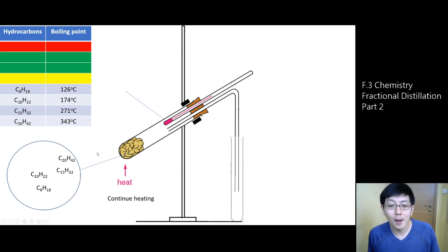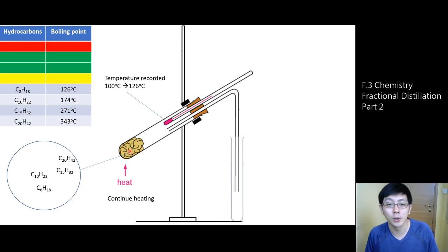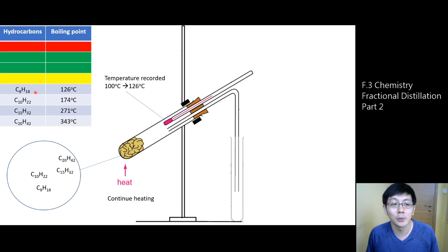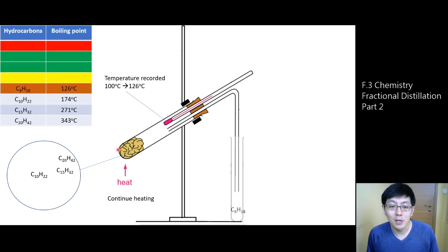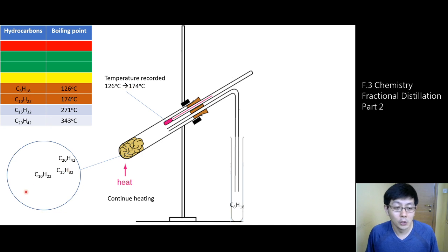This time, I use the test tube to contain crude oil absorbed in mineral wool. We heat the mixture and the temperature inside increases gradually. As the temperature increases from 100 to 126 degrees Celsius, it reaches the boiling point of one hydrocarbon — C8H18 in this case. This hydrocarbon boils and is removed from the mixture into a test tube. As heating continues and temperature reaches 174 degrees Celsius, it reaches the boiling point of another hydrocarbon, C10H22, which also boils and leaves the mixture into another test tube.